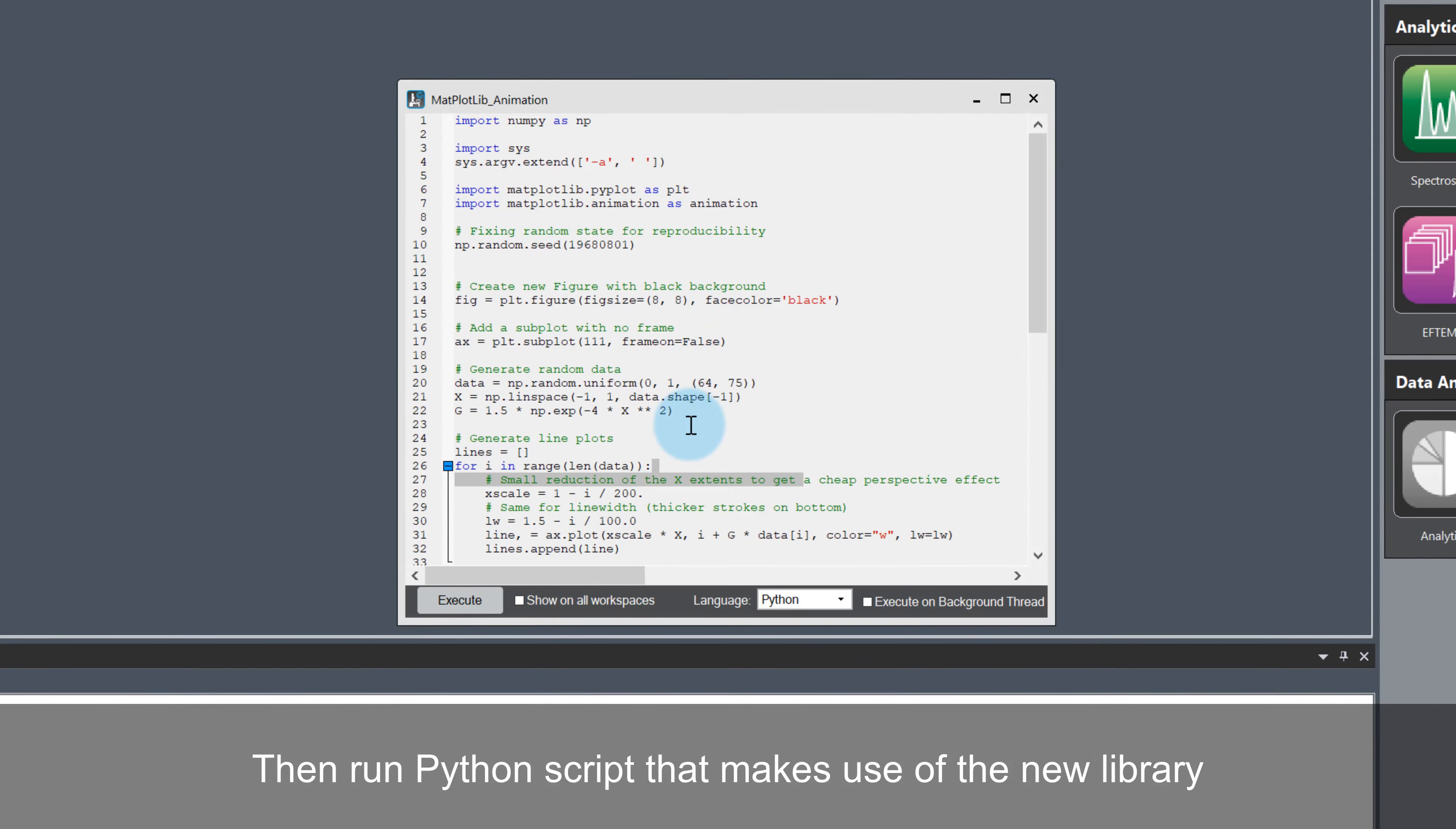Here's a more complex Python script that was prepared earlier. For Digital Micrograph Python scripts using matplotlib, lines 3 and 4 are typically needed for the script to execute successfully.